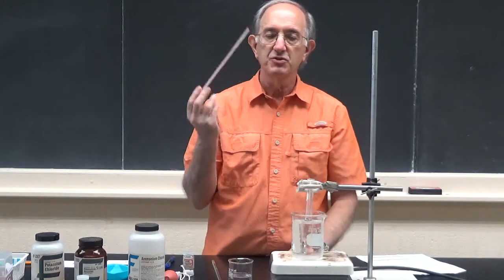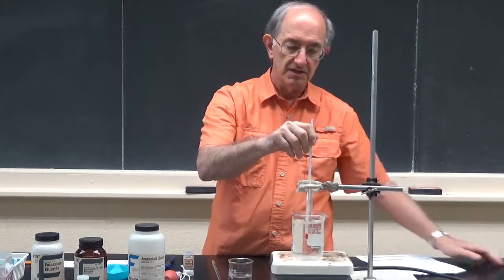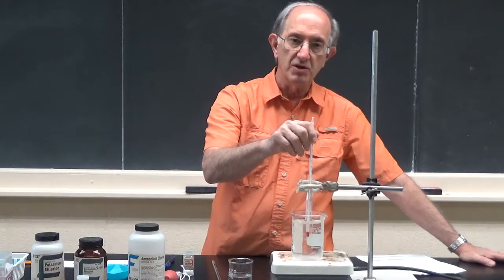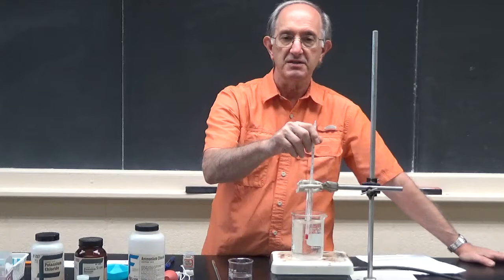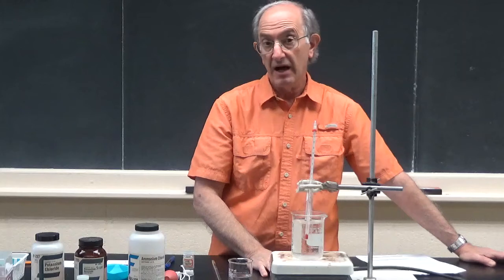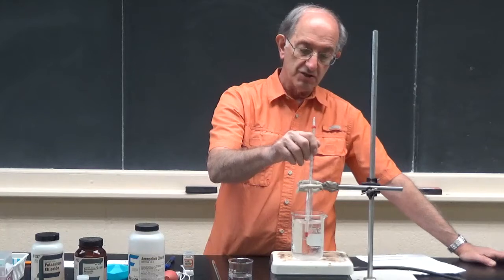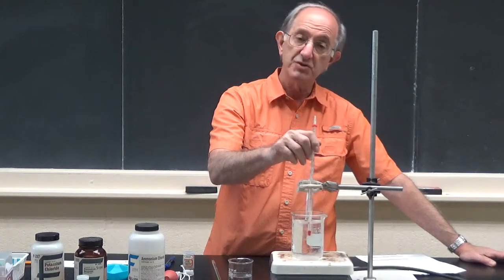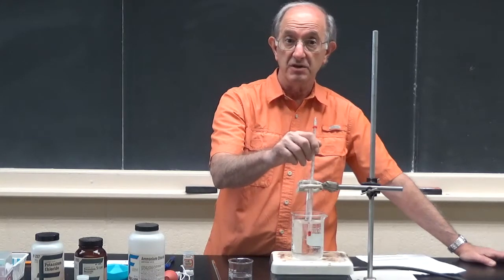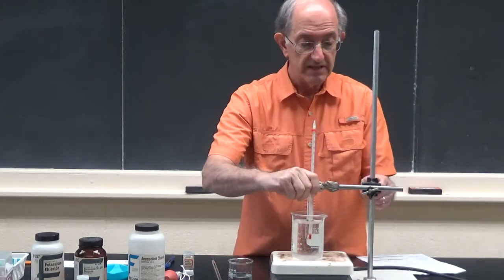And you're going to use a thermometer. You can gently stir the solid as it sits in the boiling water. And we all know that, in your experience on this earth, most things like salt and sugar have a higher solubility at higher temperatures, as do all of these three chemicals. So you're going to stir this until you see that there is no more of your potassium chloride or potassium bromide or ammonium chloride left in solution. It is all dissolved.